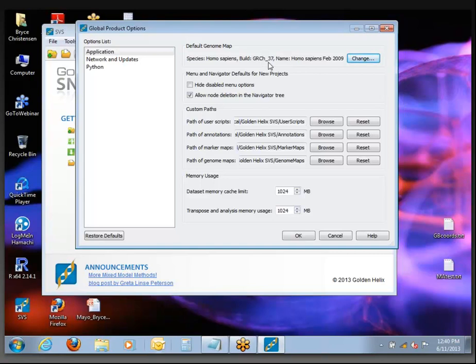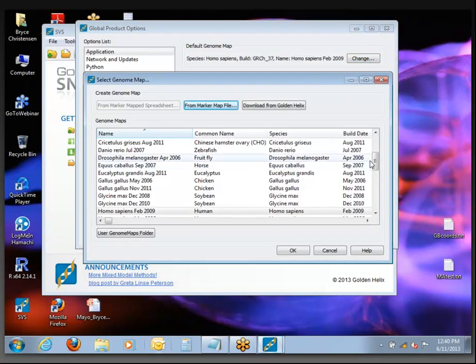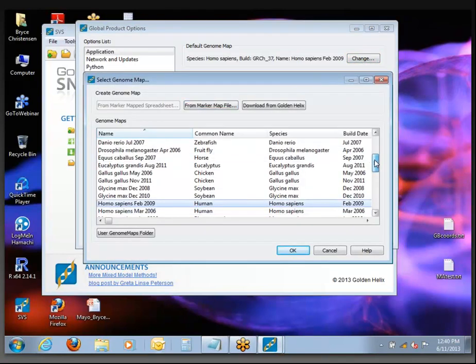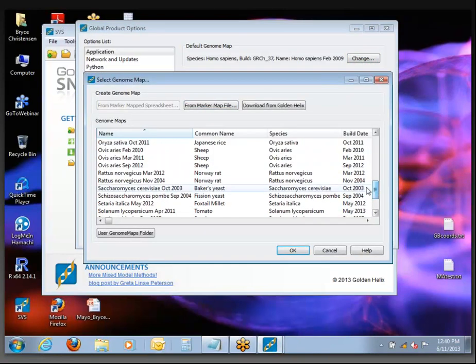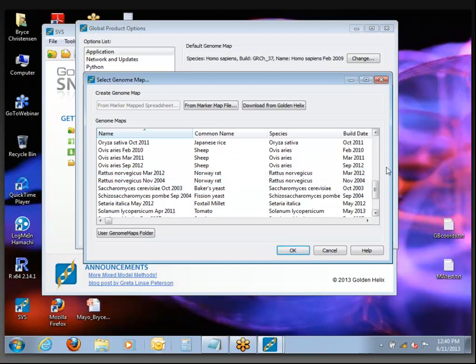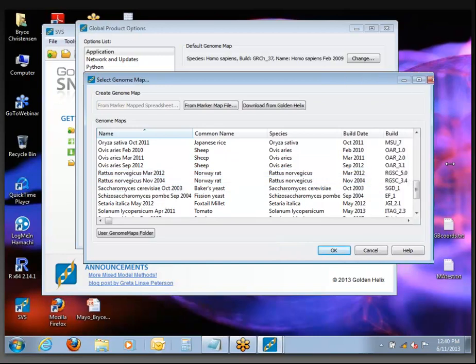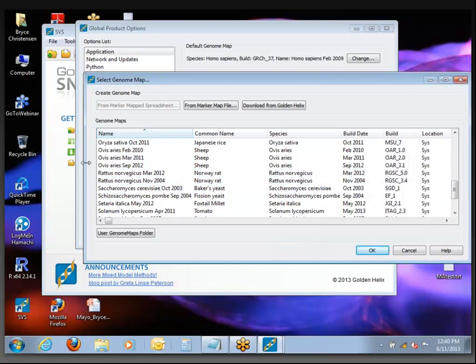Do we have anyone working with model organisms or non-human? Rob, you said you're working with mice and rats. I believe you'll find mice and rat genomes are available in here — there's Rattus norvegicus. There are two different versions of the rat genome that we currently support.